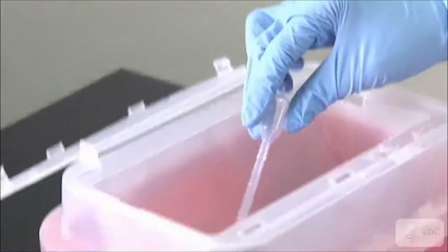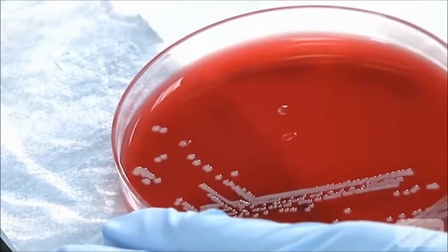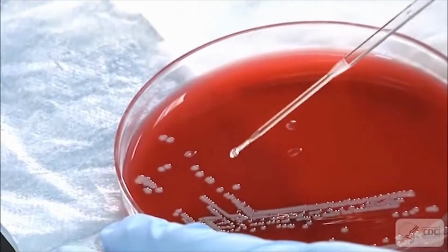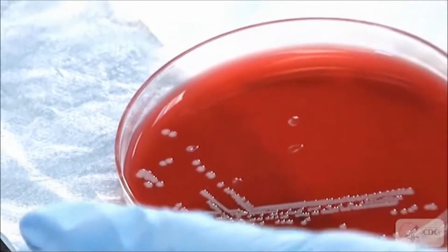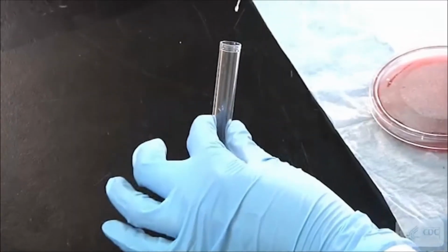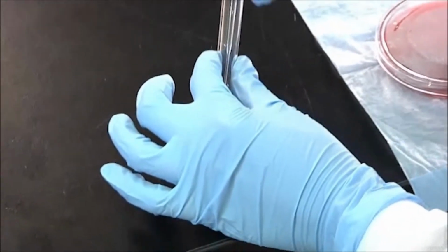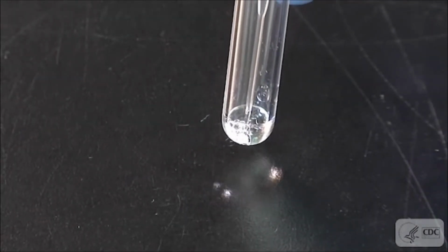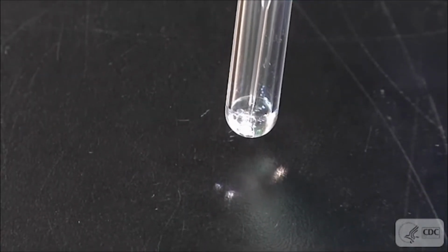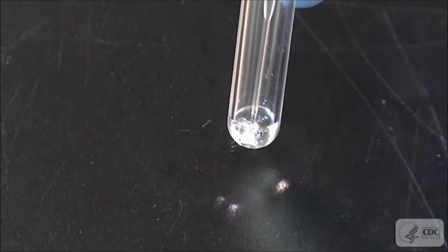Discard your pipette into a biohazardous waste container. Use the applicator stick or plastic loop to pick up a small amount of 18 to 24-hour-old isolated colony from the positive control. Place and leave the applicator stick or plastic loop in the tube. Place the tube against the benchtop or a dark background and look for the immediate formation of bubbles.